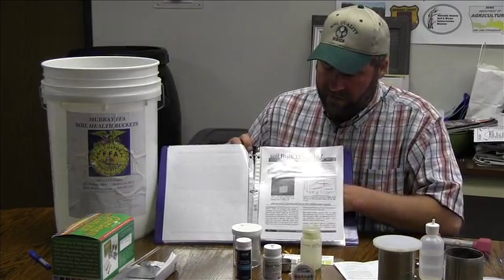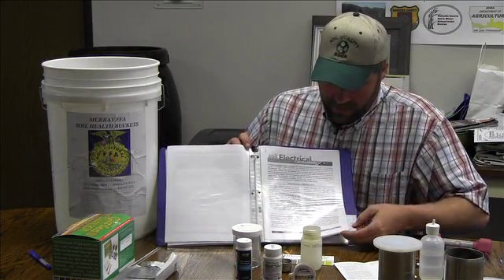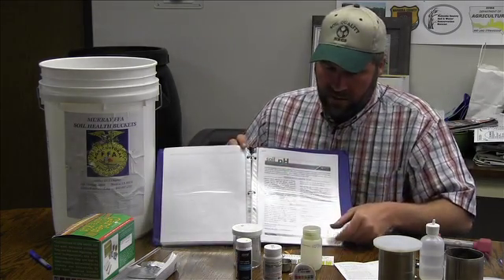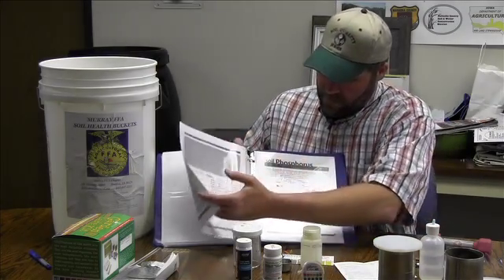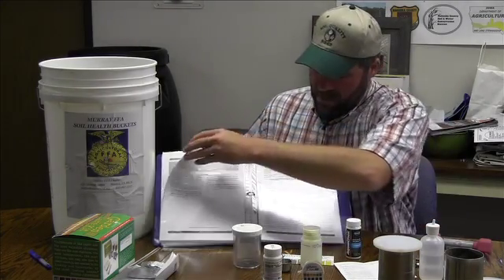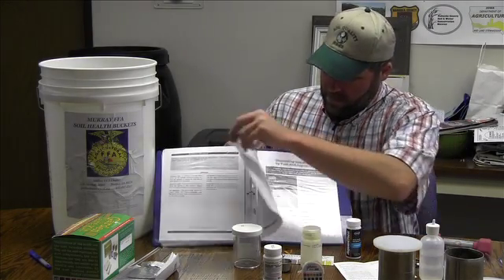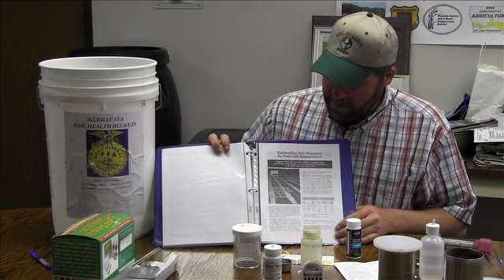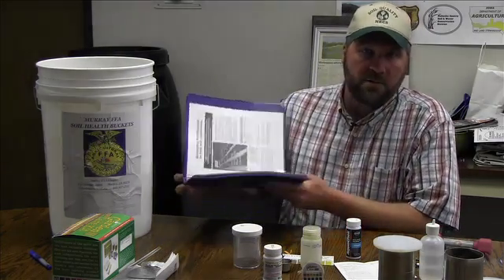You use a microwave to dry the sample and a spreadsheet to calculate it. Electrical conductivity, soil pH — that's our little orange strips to get our soil pH. Soil phosphorus — we have the phosphate test right here. Soil nitrogen — we have the nitrate test. And then the last one in the binder is estimating soil moisture by feel and appearance, which is also how you can estimate soil textures as well.